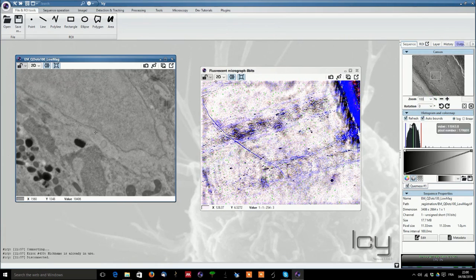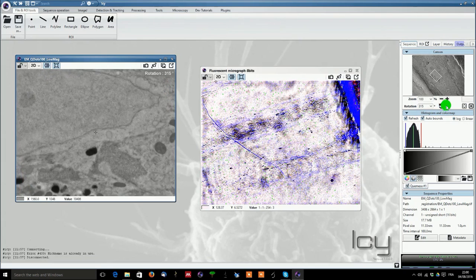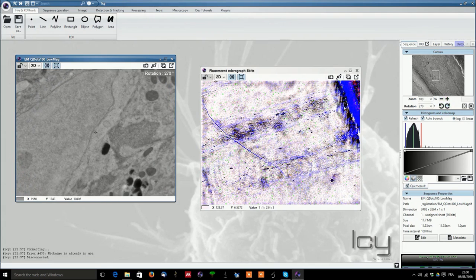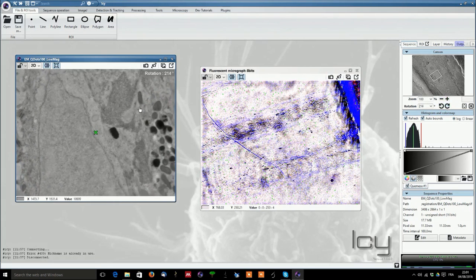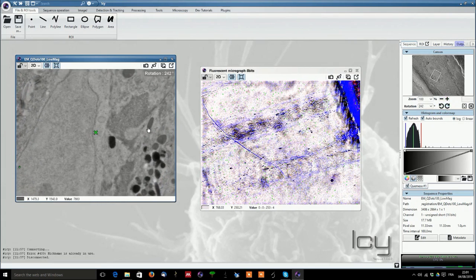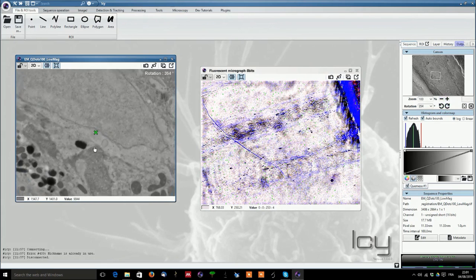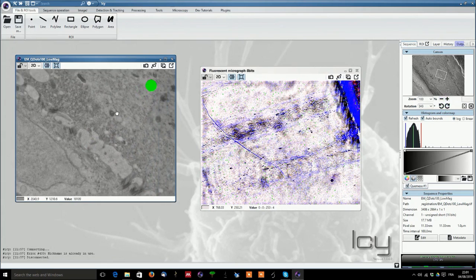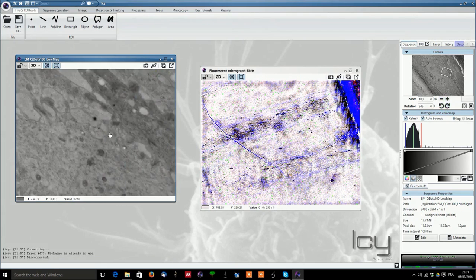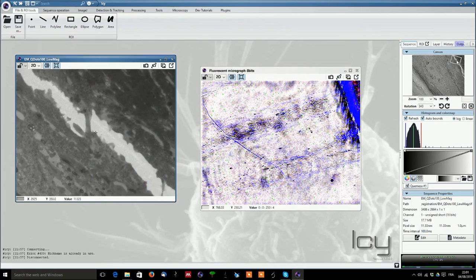What you can also do is set a specific zoom of your image and you can eventually add some rotation which are graphical user interface rotation. You can also rotate it by using a right click and rotate around the center of the image.